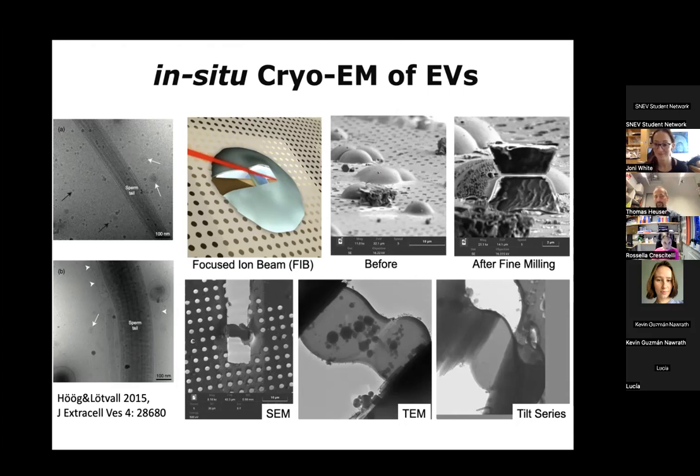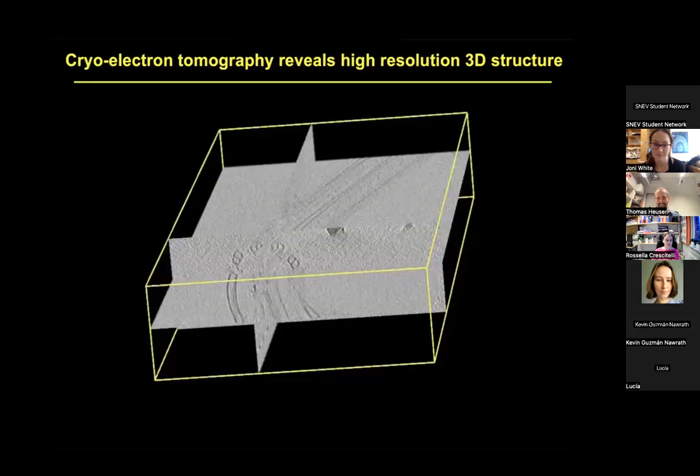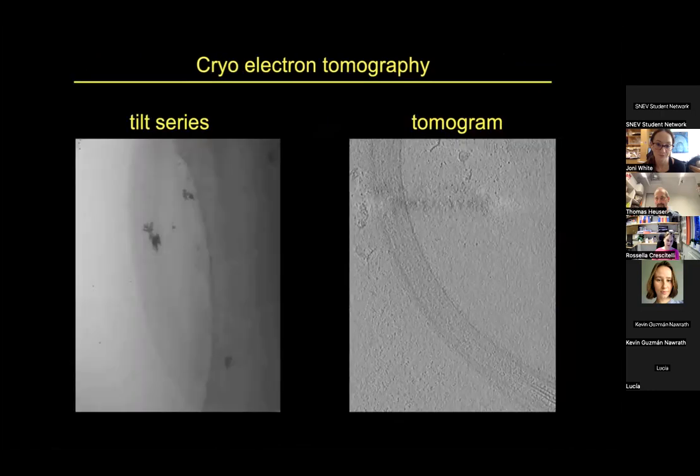Can I just ask one thing more about this 3D tomography and 3D reconstruction? Probably I know your answer, but I tried. What do you think about the chemical fixation of the tissue samples, and then the tilt and the 3D reconstruction? Yeah, if you're interested in the 3D structure, you don't have to do this in cryo. You're absolutely right. You can do this with conventional approaches as well. So this could be just simple classical chemical fixation that you were referring to.